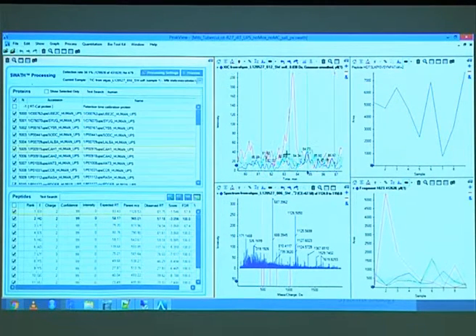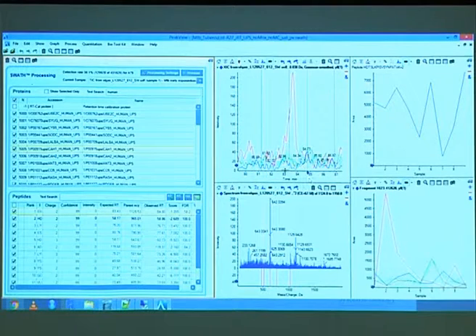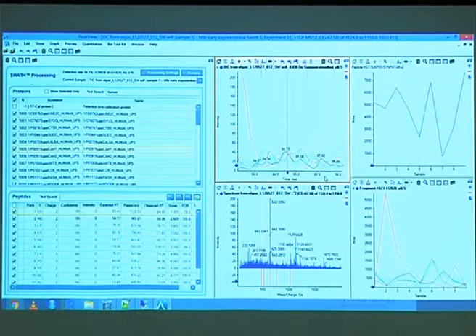And you see already up here, there is no really nice alignment of the peaks. There's not really a maximum. You see here, these two are already offset. And here only the green is kind of in the middle, and the blue and the pink are on the left. So this is not how a nice peak looks.